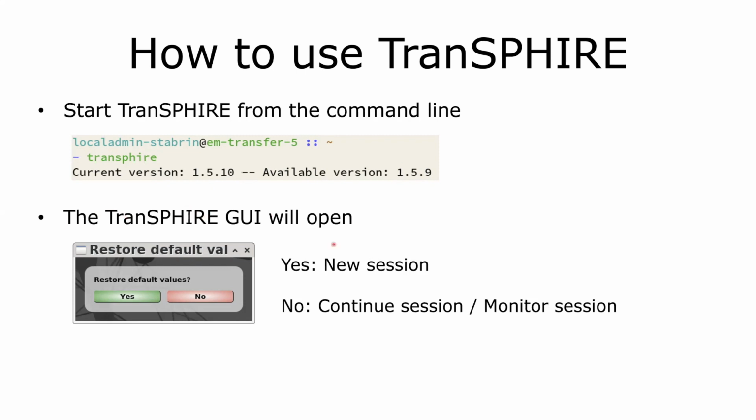And you might want to check on the website if those updates affect your current workflow or not. Once the TranSPHIRE GUI opens, it will ask you if you want to restore your default values, yes or no, which sometimes leads to a bit of confusion. Most likely you want to press yes if you want to start a new session, so that you don't load any settings by accident from a previous session that you don't want in your current session. Press no if you want to continue your session because you needed to stop it for some reason, or if you want to monitor your session. It's possible to monitor a session from a different computer and start another TranSPHIRE instance, for example, just to get the visualization.